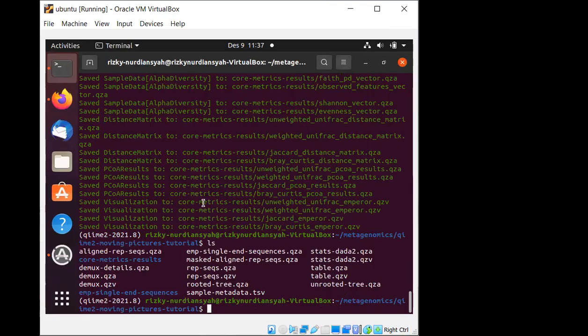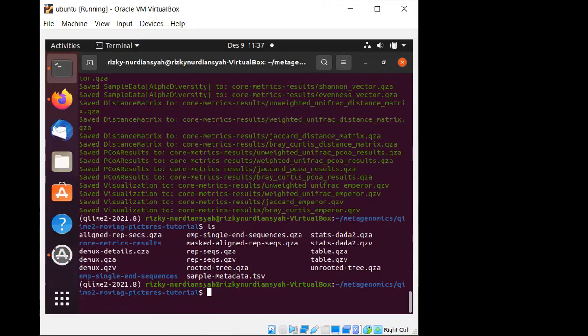For this one, the visualizations are not in here, so that's why I cannot call them. They will be in this particular area. We will come back to that later.